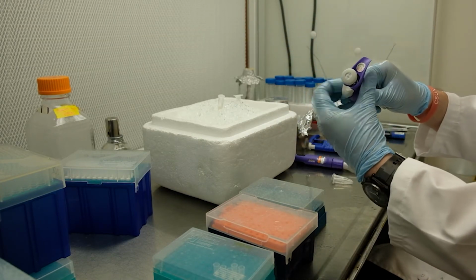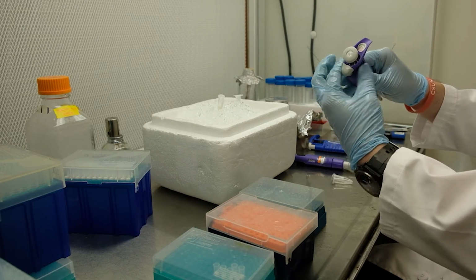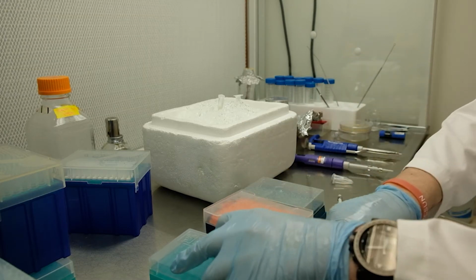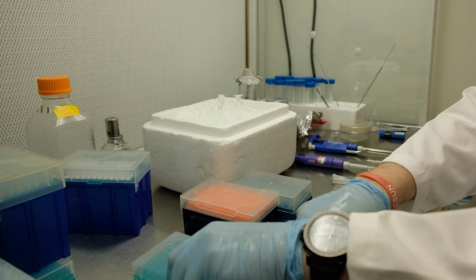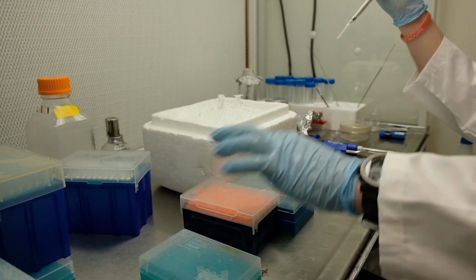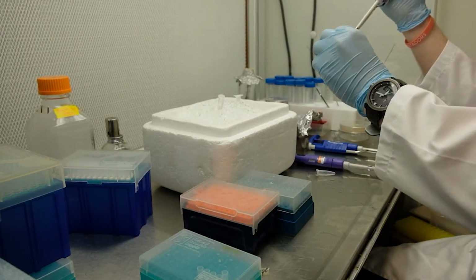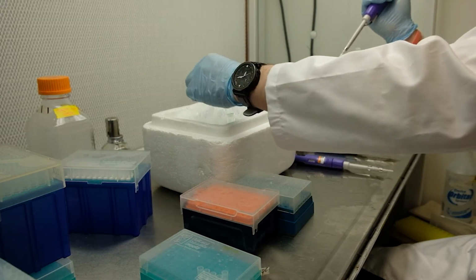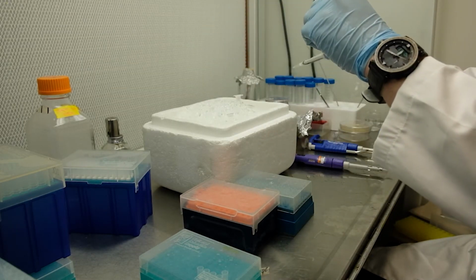Adjust your pipette to the volume that you're going to transfer. For us, it's going to be 20 to 50 microliters. And perform the actual transfer: cryoculture A to tube A, cryoculture B to tube B.